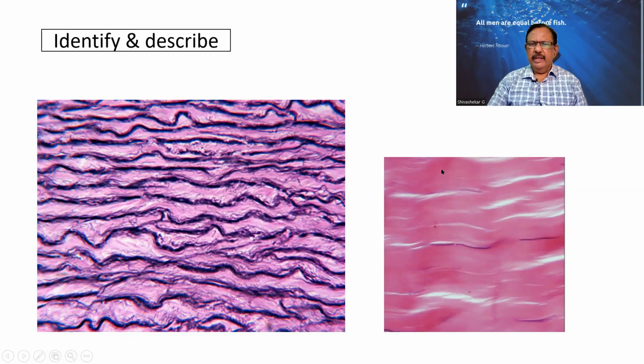So this is a tissue with bundles of spindle-shaped cells, or rather thick bundles. Here, I am not able to see any nuclear material. It is homogeneous, a little wavy, with long ribbon-like strands that I am making out. Hardly in one area I am able to see a bluish, maybe a nuclear ribbon. So this is collagen.